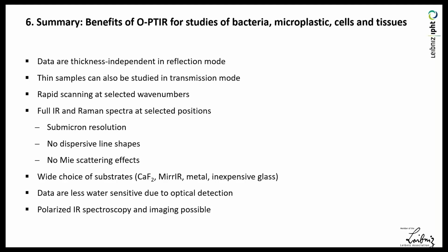Yeah, so the cells had a size between 10 and 20 micrometer diameter, and they selected 5 arbitrarily positioned, maybe 1 in the center and then 4 at the margin, and then the 5 spectra were averaged to compensate the variations that come from the different cell positions.